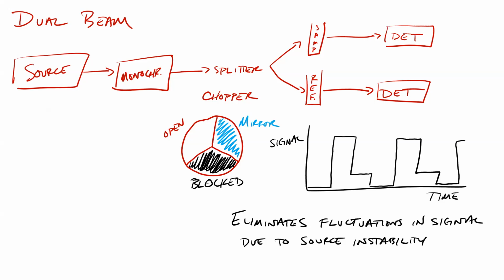So the computer, again, knows exactly what's going on, when to take data from which detector. And so, there's just a lot of engineering that goes into making an instrument like this. And so these are by far the most expensive UV-Vis that are out there, but they also give the most stable data and often the most accurate. Okay.